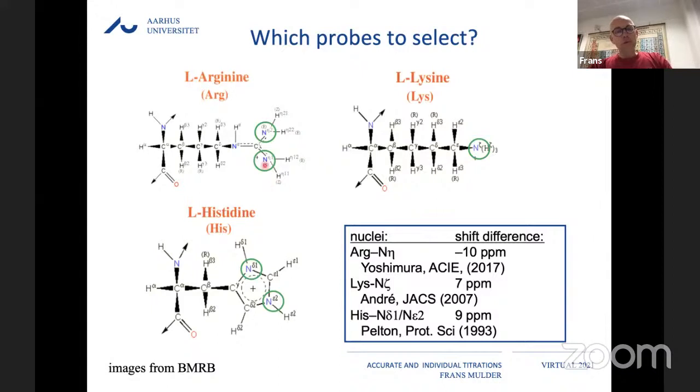There has also been some beautiful work from Fleming Hansen's group recently to address this. And I'll show you a little bit at the end how the arginine experiments can be done following these nitrogens, despite the fact that the arginine guanidino group is undergoing rotational motion, which causes some problems in some of the NMR spectra. But one can get around that nowadays by using carbon observation NMR.